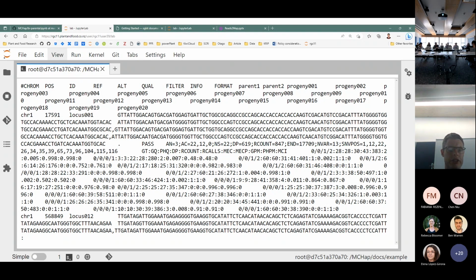So each of our genotype calls is a tetraploid call. I will say that if you have a mixed ploidy population, you can actually specify the ploidy of each individual using an additional file. And again, with the inbreeding estimates, if you have more specific inbreeding estimates for your population, you can include an inbreeding coefficient per sample. I'm not going to go through every field here because VCF is quite big and verbose.